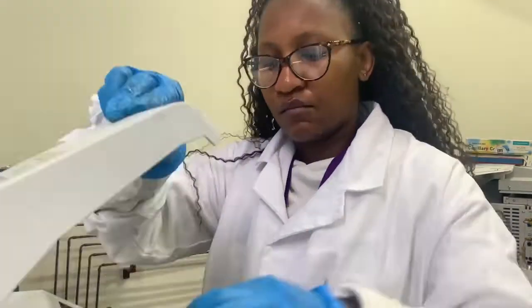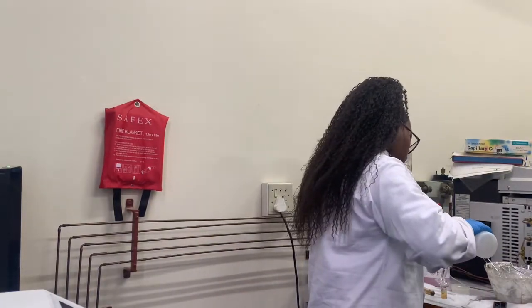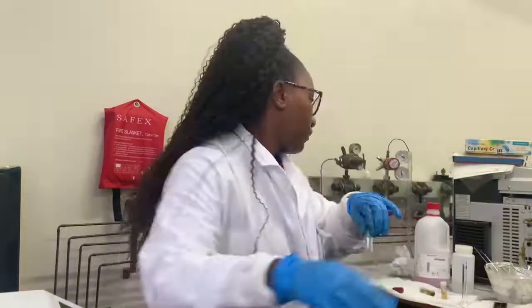So I use UV to check the absorbance of my porphyrins, so that I should know exactly where my 1 Soret band is and where my Q bands are, because they have to align with what literature has given me. So that is why I use UV. So here I was just preparing the sample and running my samples through UV.